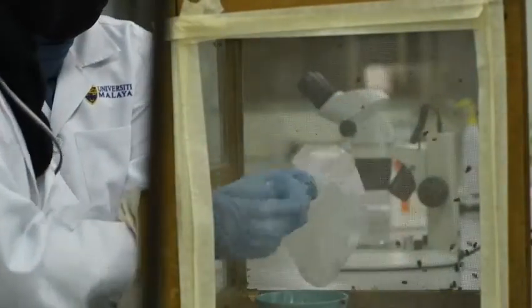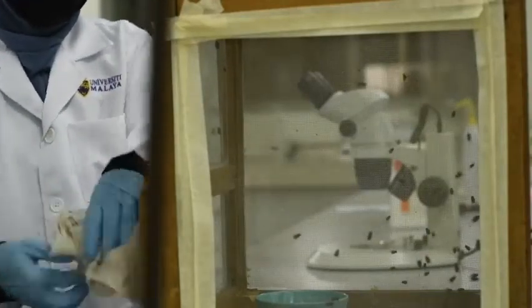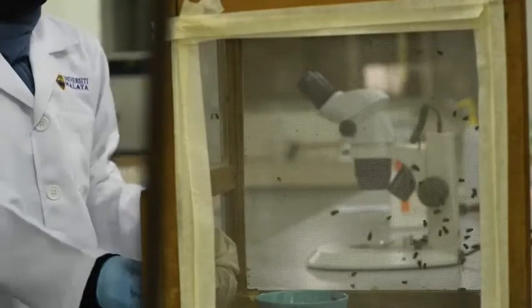After we capture all the blowflies, we need to anesthetize them by freezing at 0 degrees Celsius for 3 to 5 minutes.